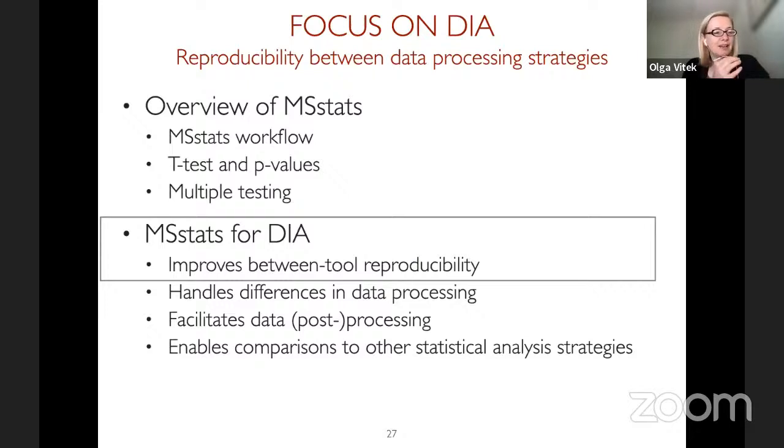Now we have half an hour left, so I can tell you a little bit about the methods implemented in MSstats, and there is a lot. Just like last week, when our speakers had to skip over many details, we will have to do that too. I will just have a few vignettes which hopefully convince you that it's worthwhile working with specialized methods for our data as opposed to some generic methods which are available in R or in Bioconductor or in Excel for that matter.